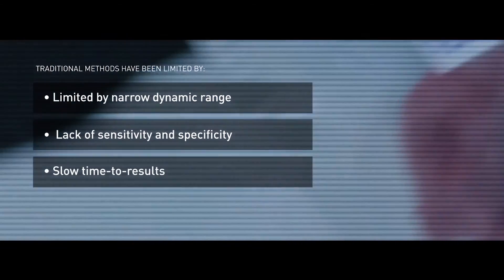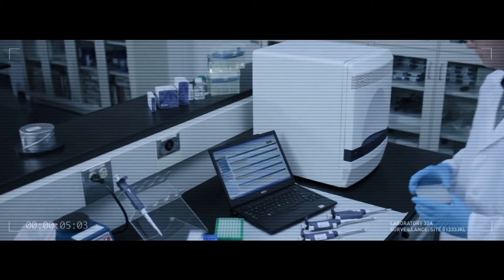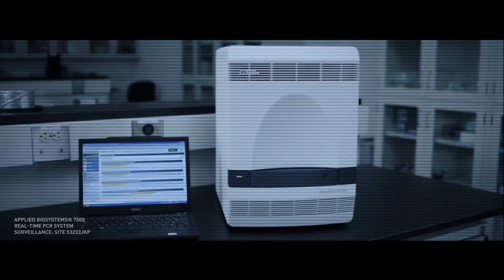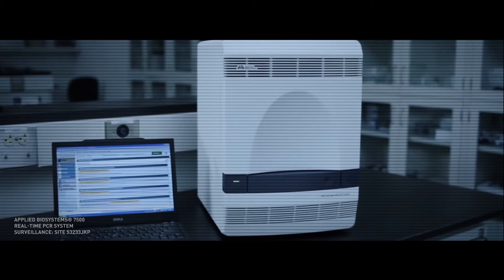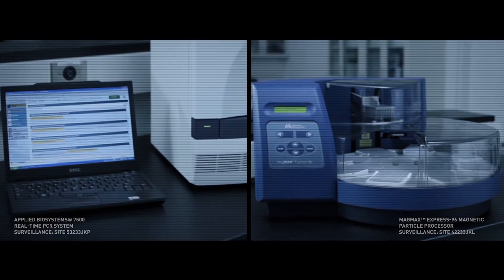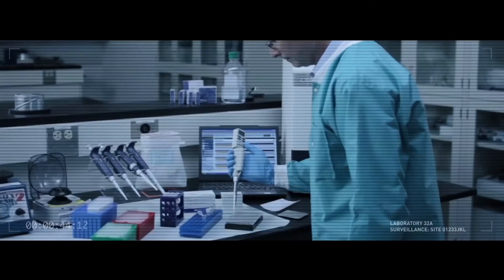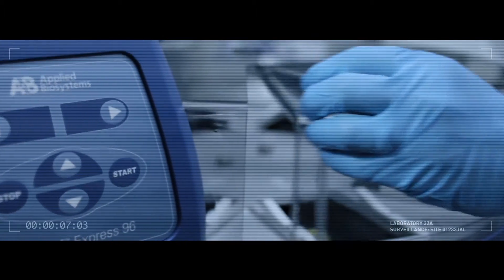The response to these challenges is a revolutionary new Applied Biosystems solution. Utilizing the 7500 Fast Real-Time PCR System and the MagMax Express Magnetic Particle Processor, they have created a single efficient platform for multiple impurity and contamination assays.